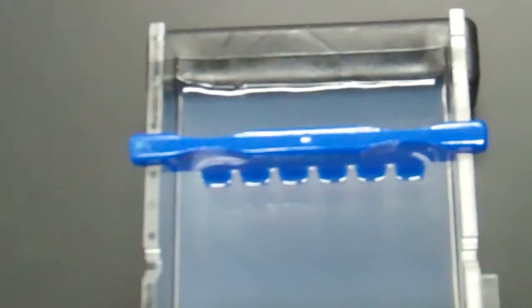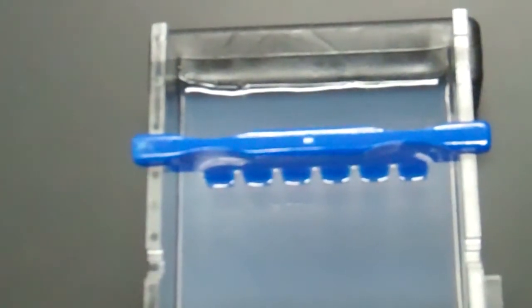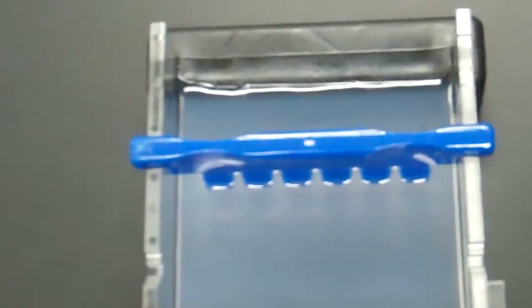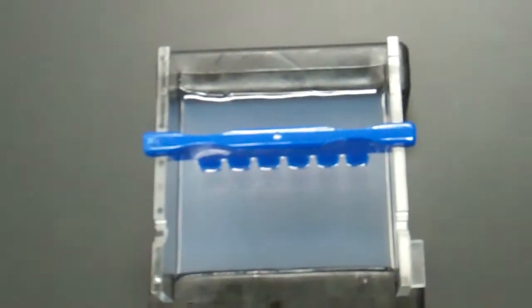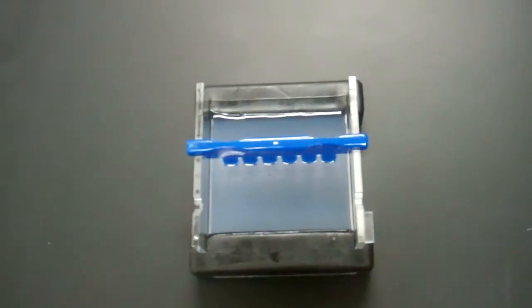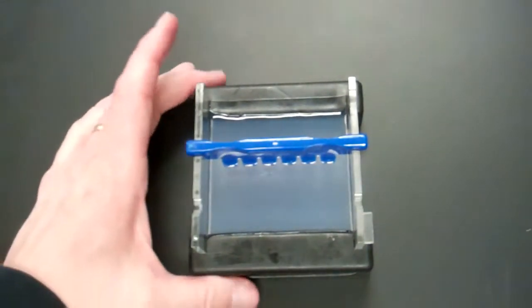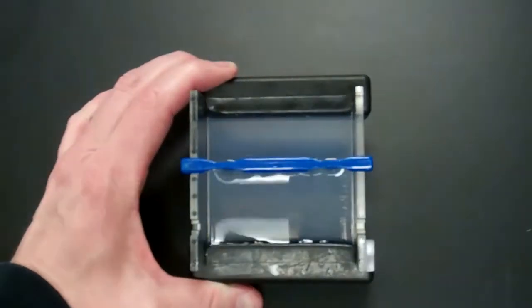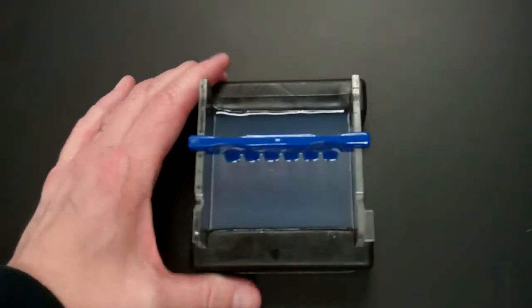And now I want to show you how to remove your gel slab from your casting tray. So you set this up during class and now it's ready to be taken apart.